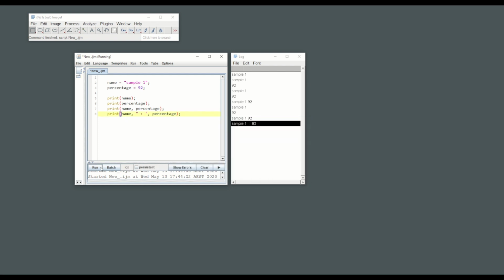And let's check if this also works. So it works, and when we need to change the value, in this case, we can simply change the first 2 lines instead of the entire script. In another example, when we decided that we like to use this style of printing, we can also use the same style with the same variable and repeat in the same code.